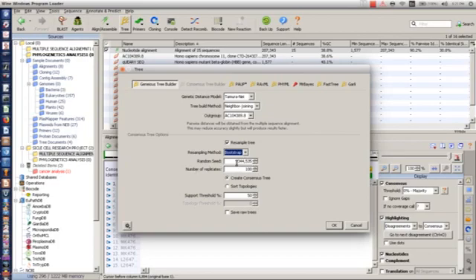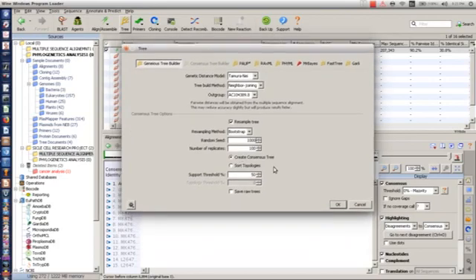The random seed now should be 1000. Whenever you're conducting a phylogenetic tree, always put your random seed to 1000, as you can see, while the number of replicas should be 100. Now, create consensus tree or sort of topology is just an option for you to be able to run your tree in order to have accurate results.